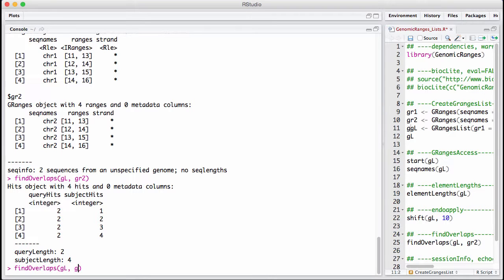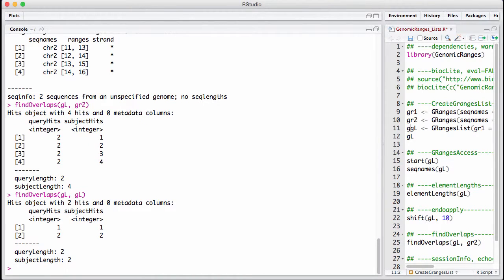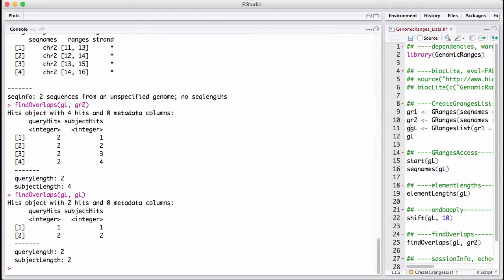In the same way, we can do findOverlaps between the two gRangers lists. This is not too interesting. Everything hits each other. But this is kind of a very natural way of using findOverlaps for gRangers lists. But it's a little bit different from what happens with gRangers.